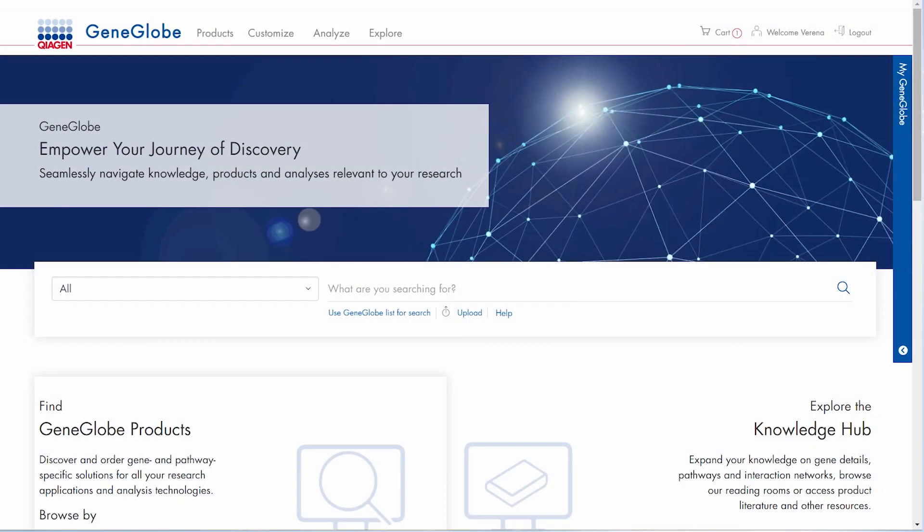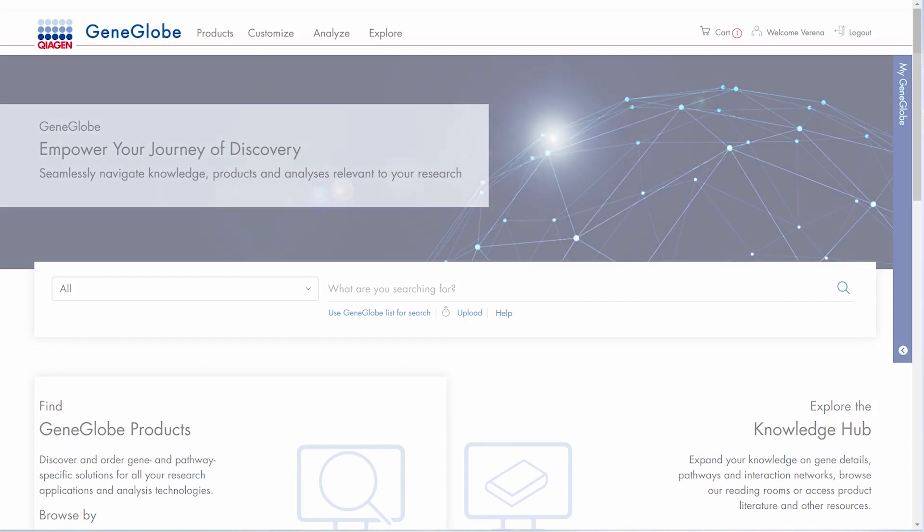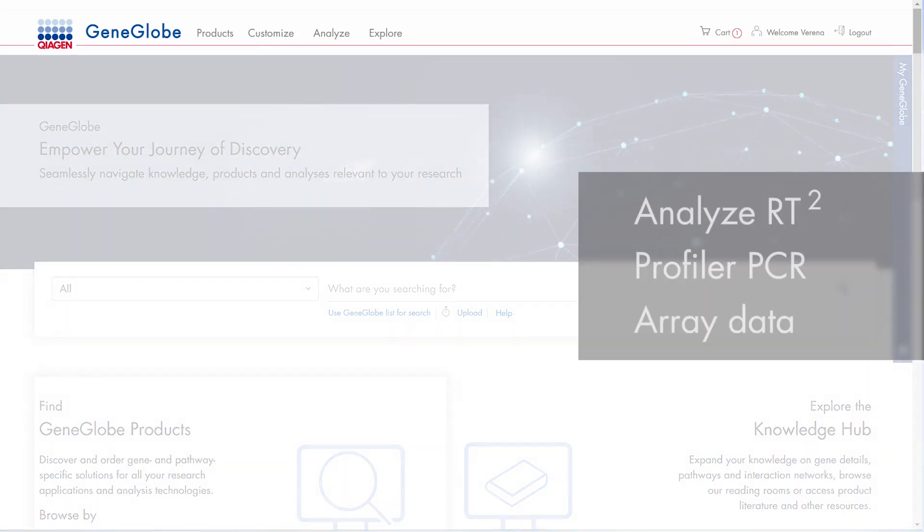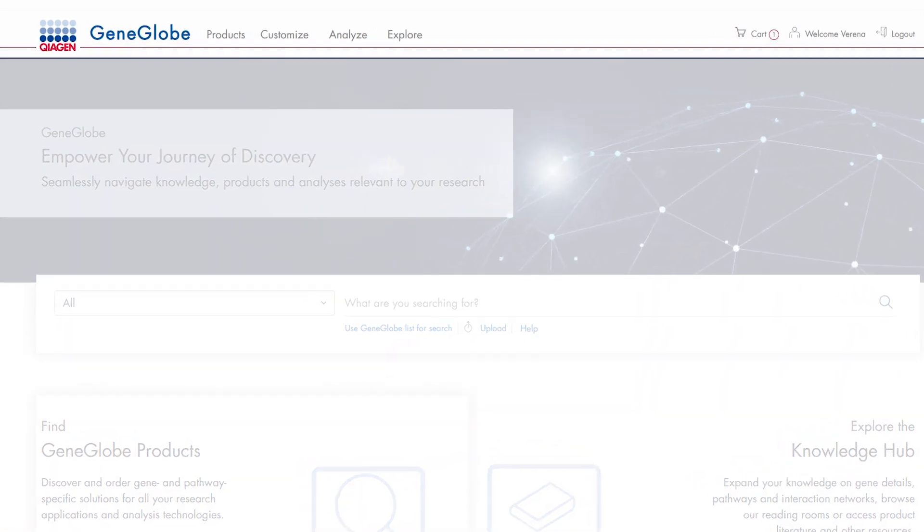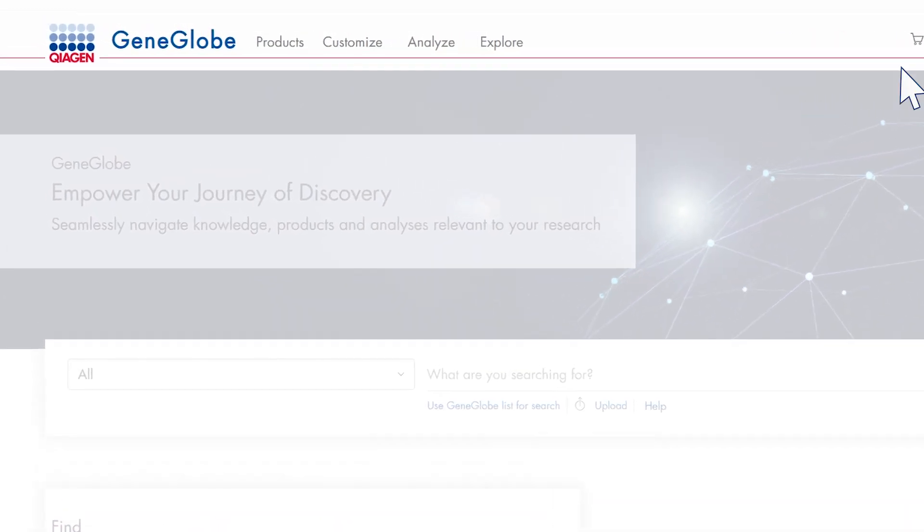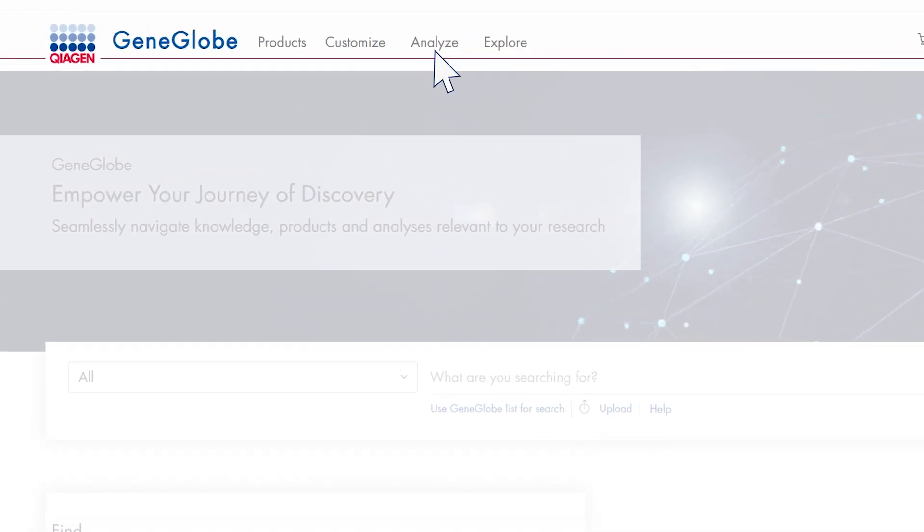In this demo we will show you how to analyze data from an RT-squared profiler PCR array using the GeneGlobe Data Analysis Center.